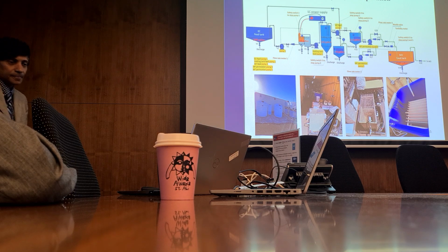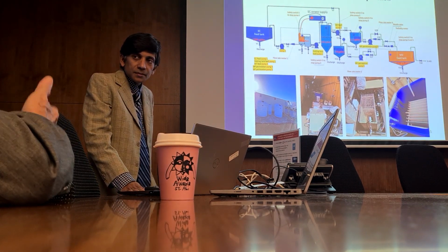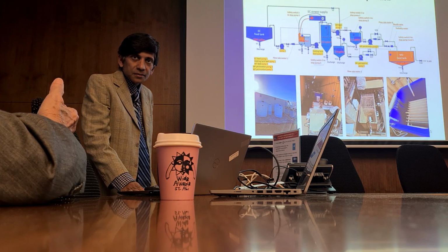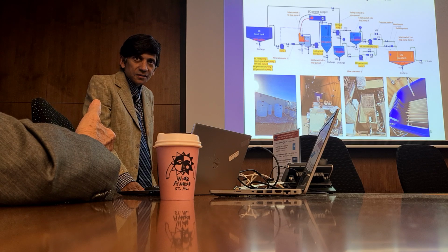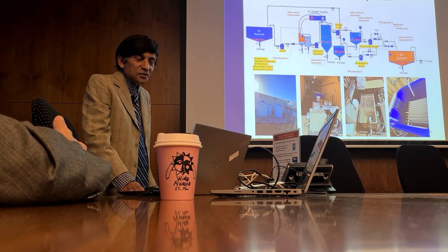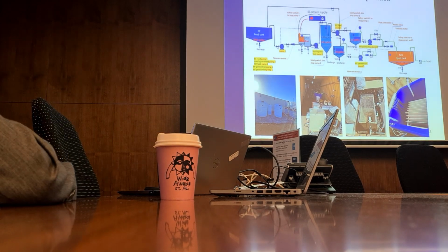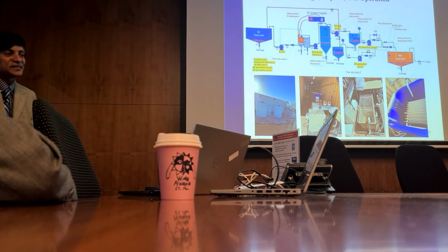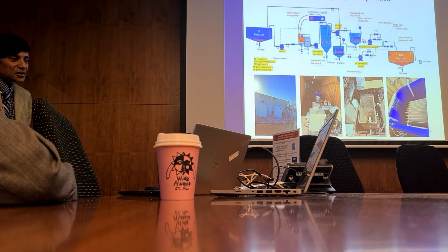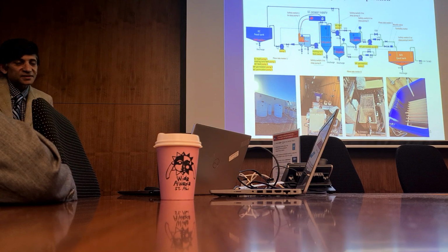Essentially, what I am trying to ask is how much water you can recover from the MD, from your original feed. That's a very good question, and that's related to the total dissolved solids. Again, I would look at the paper because I didn't really do that part, but I remember it was not that high. Maybe about 40% or something like this. It wasn't huge, about 50%.